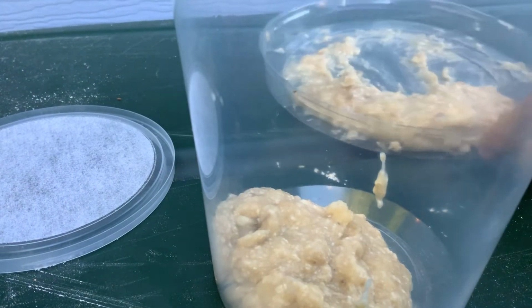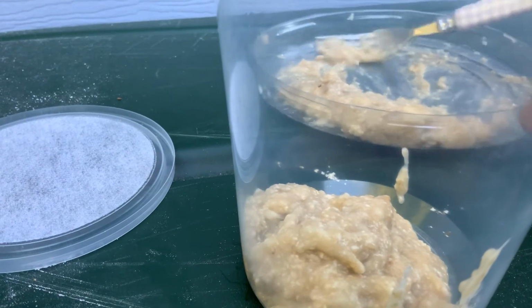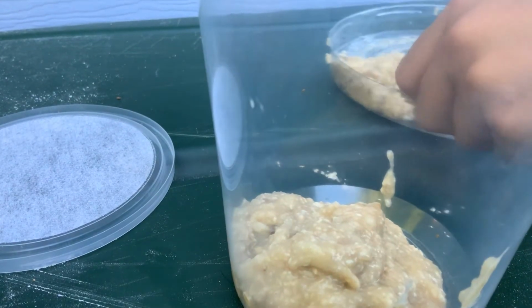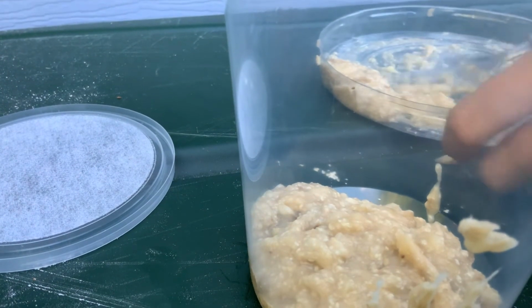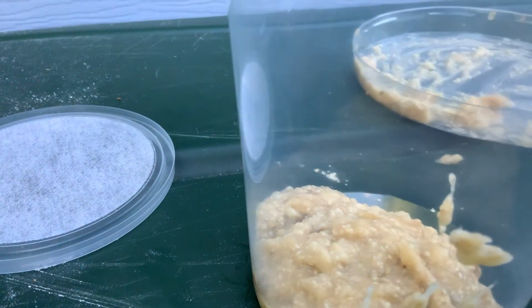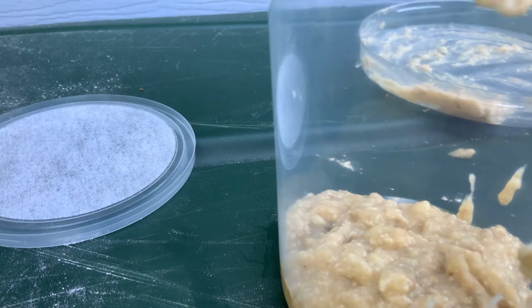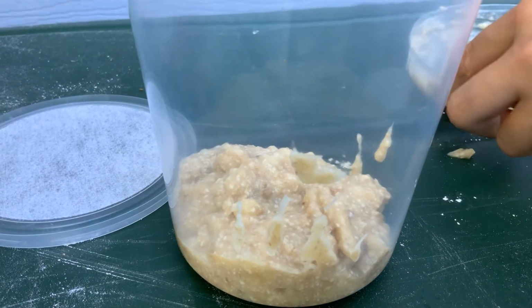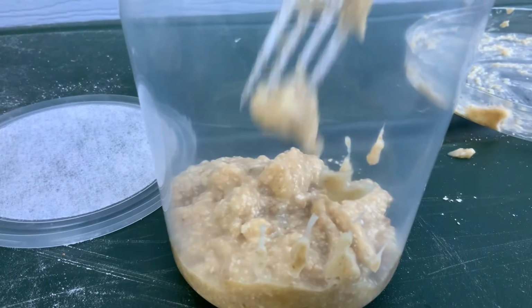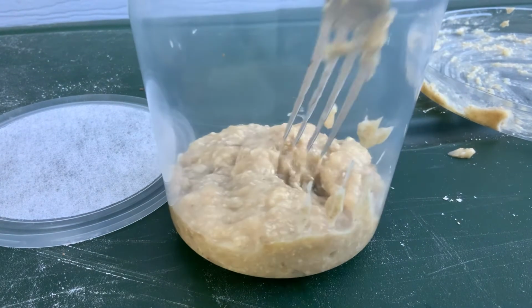It's a lot of media, but that's good because there will be a lot of flies in here. Later I might add some more vinegar, but for right now I think it'll be okay. And I don't think that this will dry out anytime too soon. You can use store-bought media, but that stuff is expensive, and I think this is a lot more fun, mushing stuff up. But that is because I'm a kid, so you guys decide what you want to do. Quite some media there. Good job.